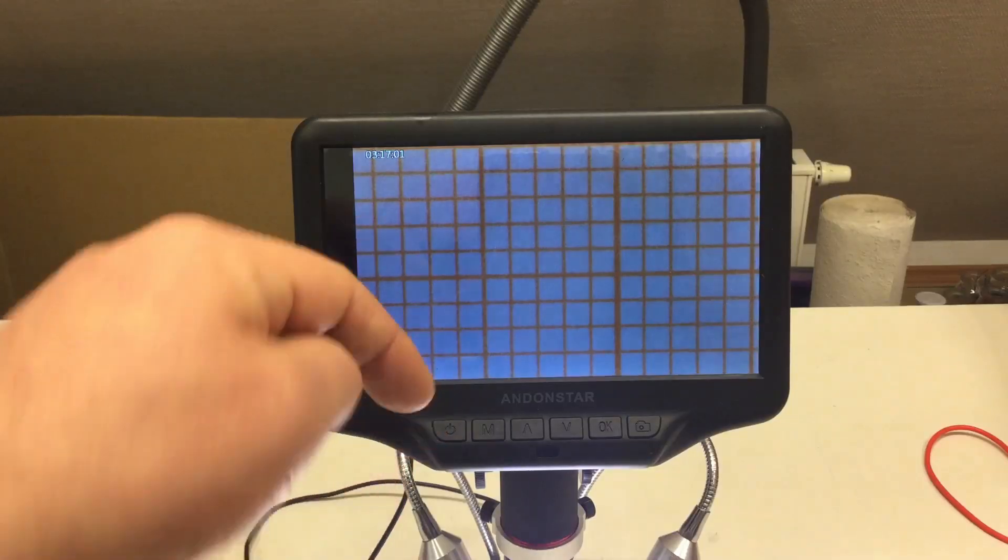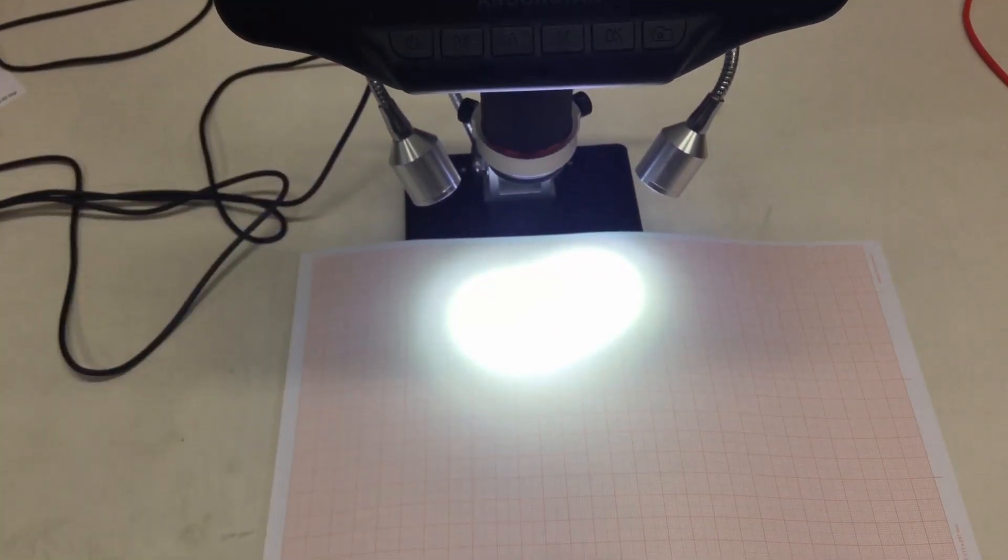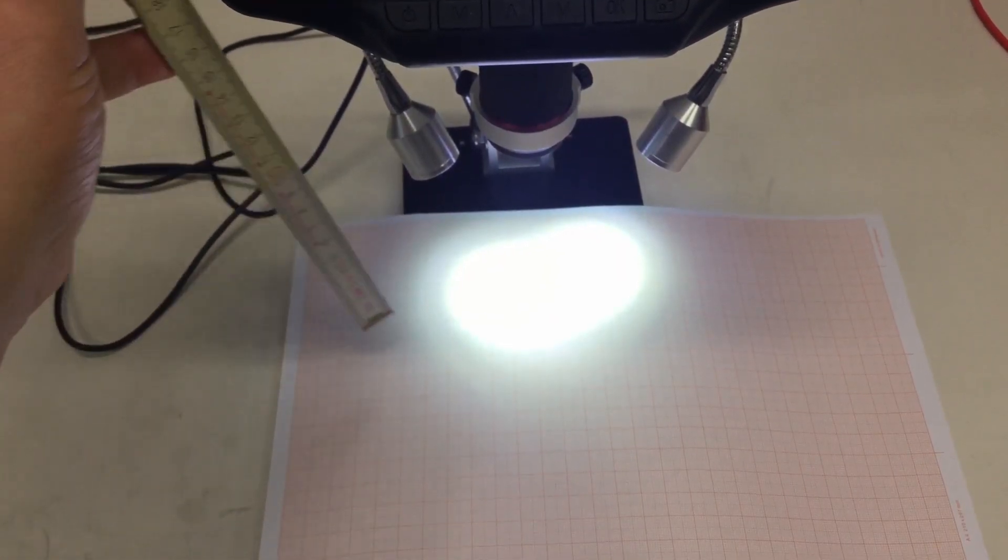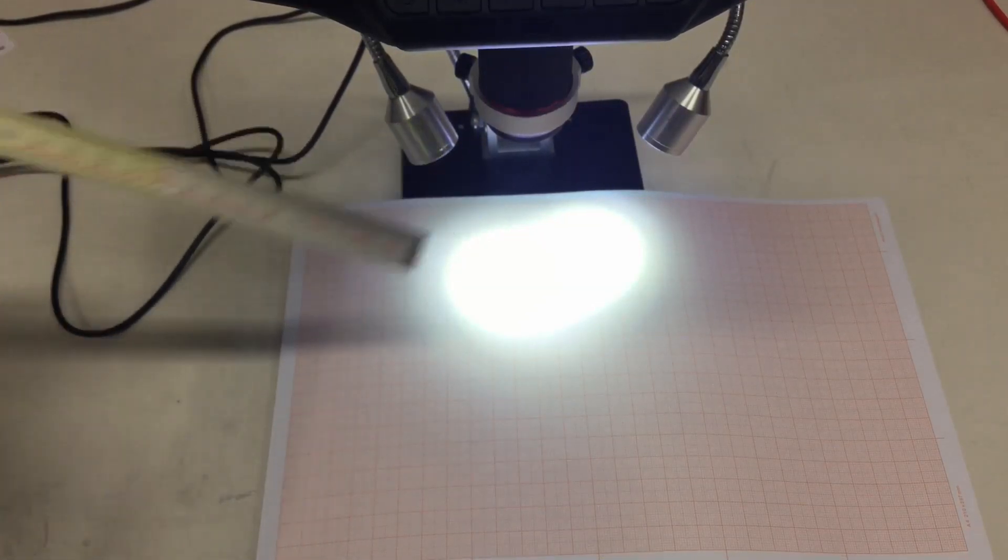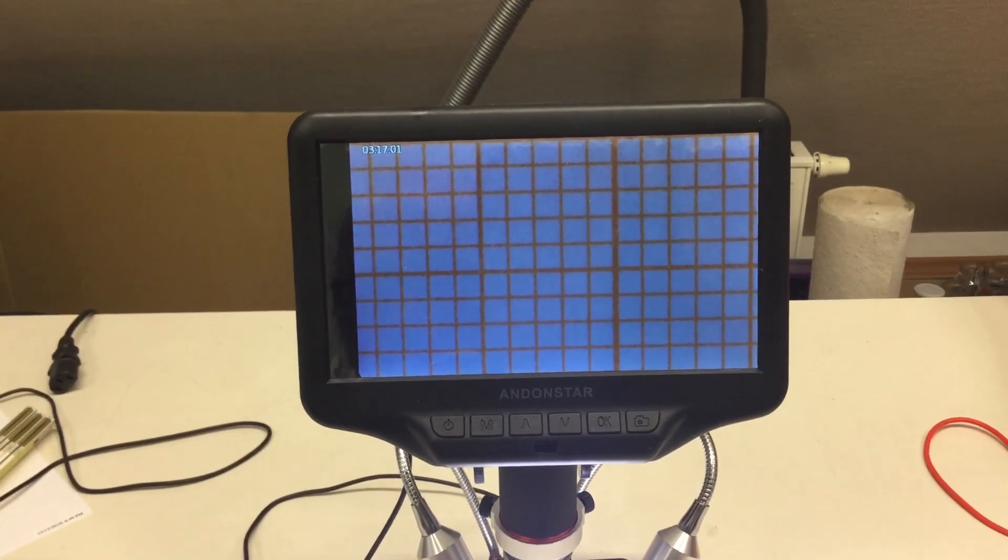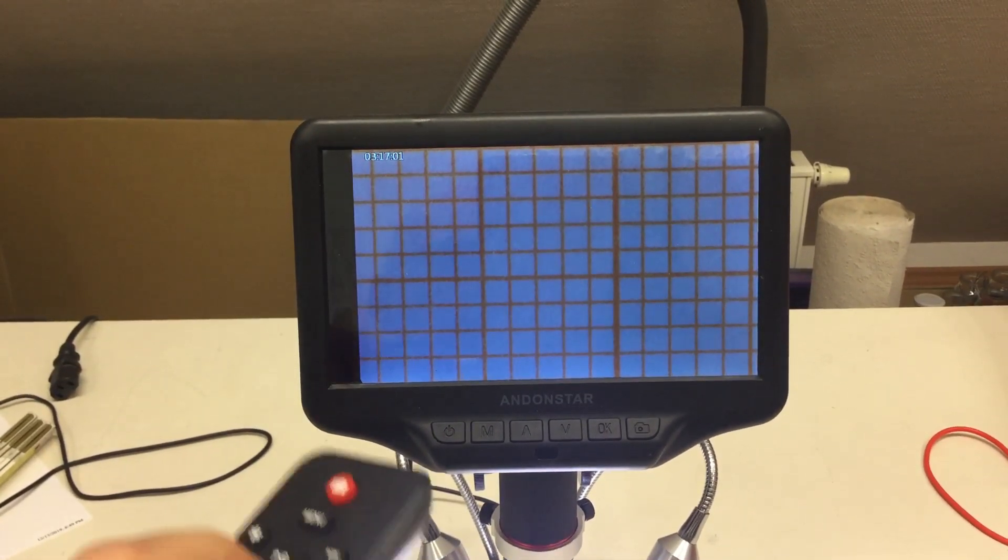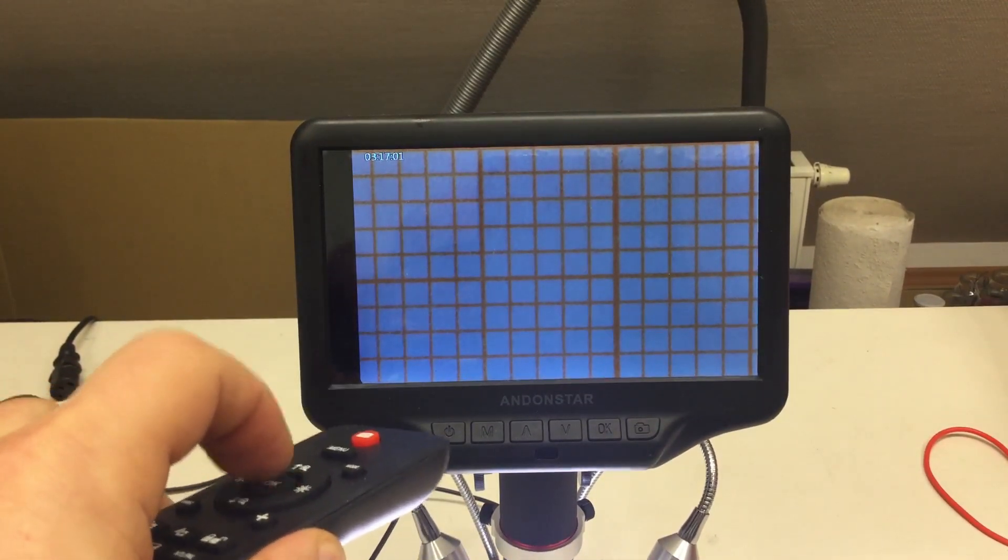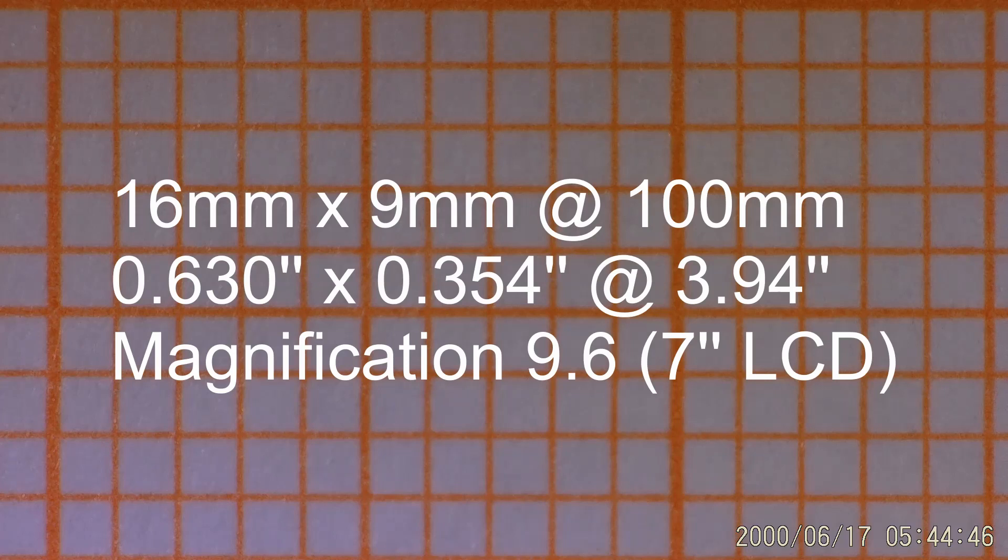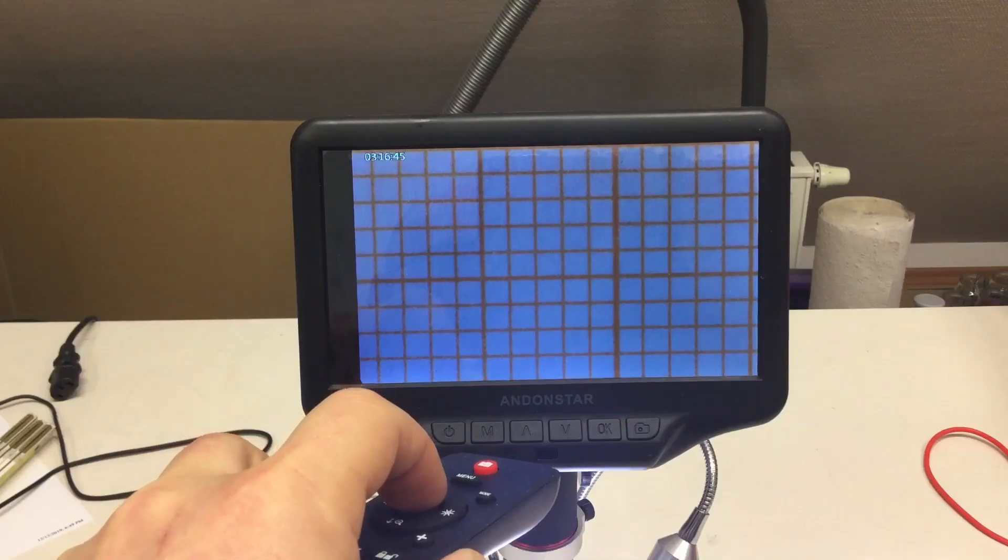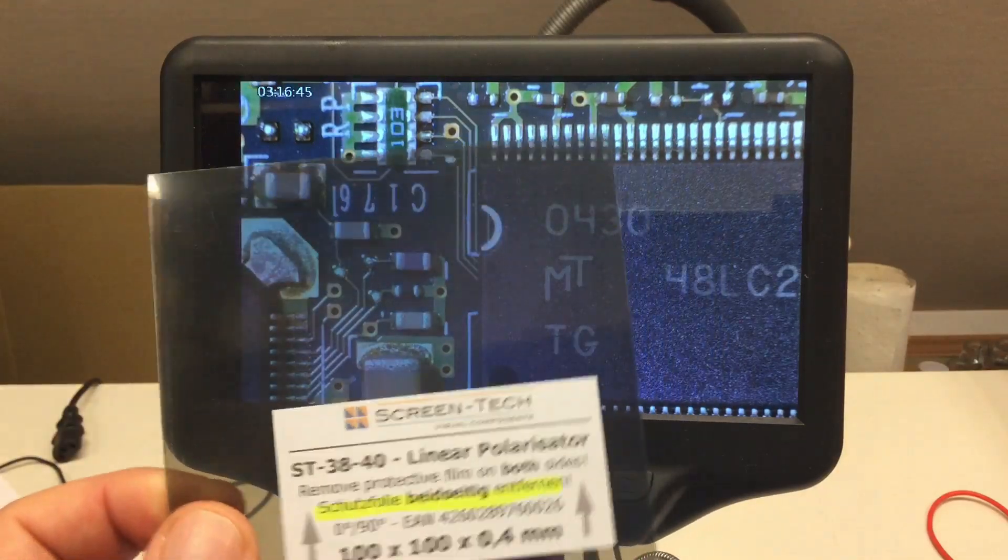Now, I have some graph paper down below here, and the distance to the lens, I measured it. Including the UV filter is exactly 100 millimeters. And I will give you a short recording of what that actually looks like recorded. But that should be enough. Can I switch that off again, please? Again, off. Okay, thank you very much.